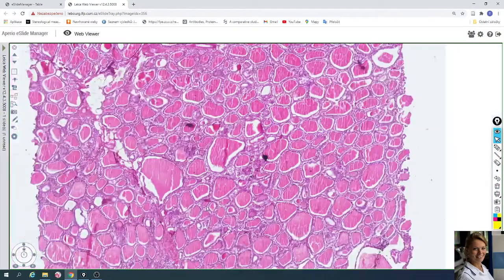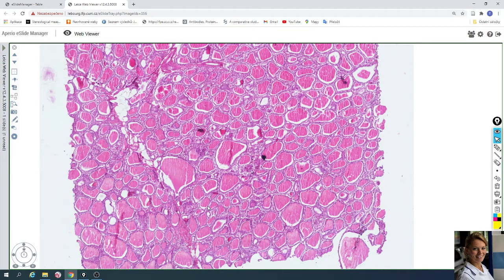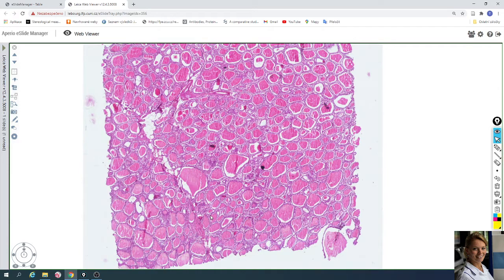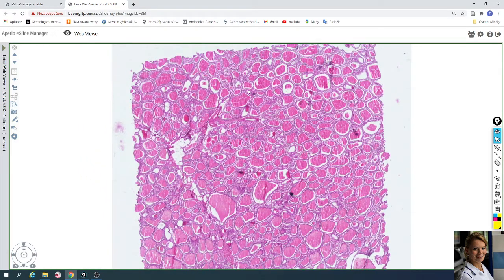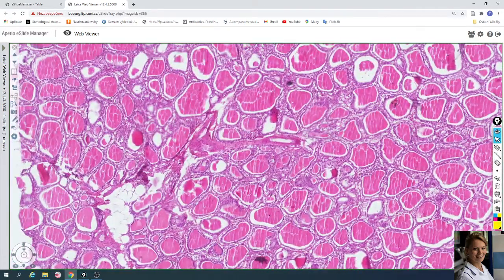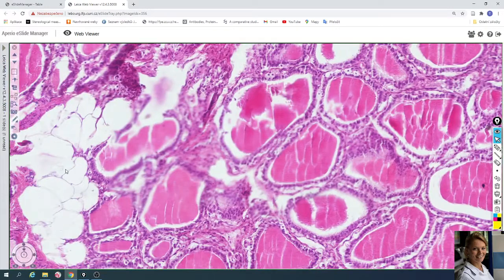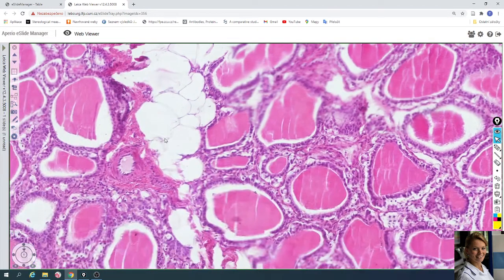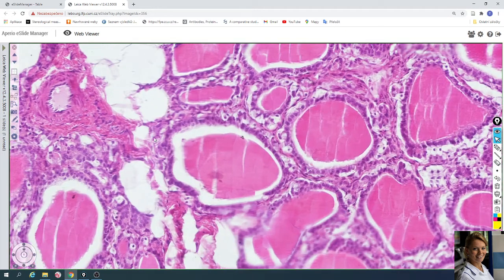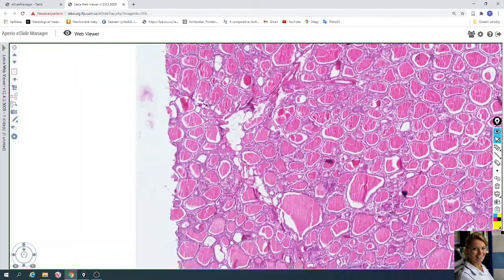The thyroid gland is surrounded by a connective fibrous capsule. From this capsule arise fibrous trabeculae — thin fibrous trabeculae containing blood vessels; sometimes you can find fat tissue as well. This is an arteriole. These fibrous trabeculae subdivide the thyroid gland into lobules.